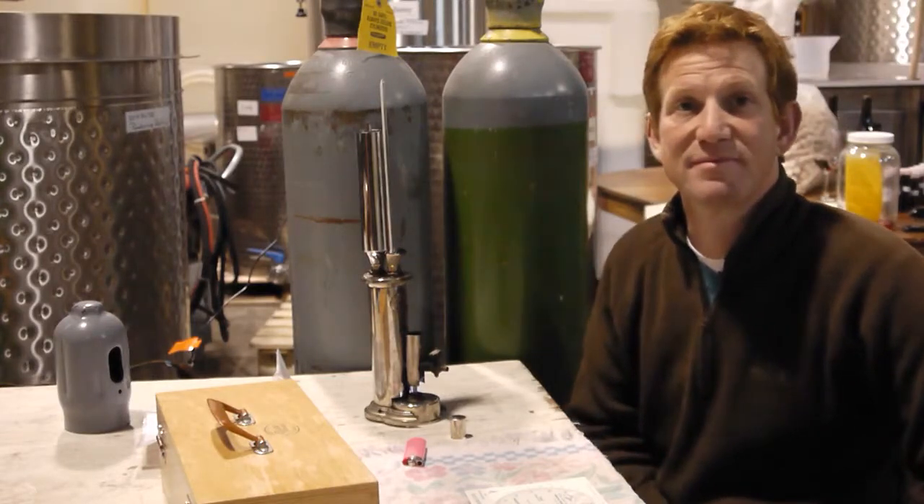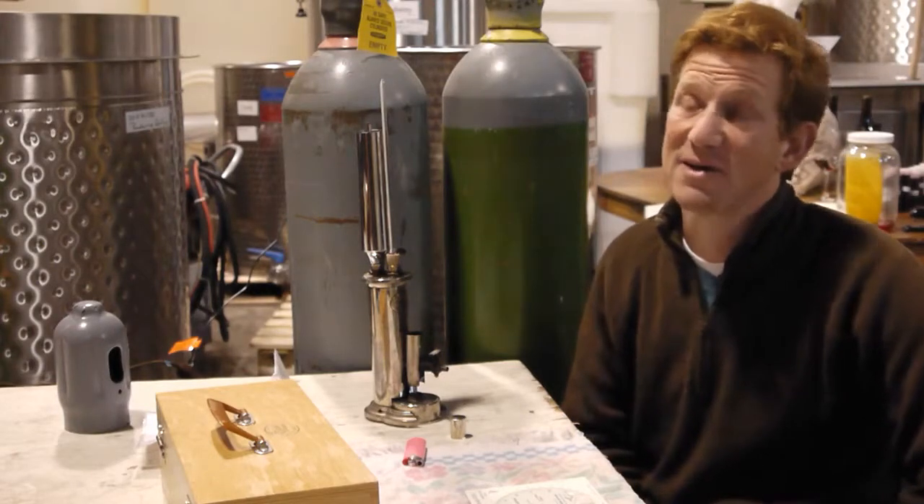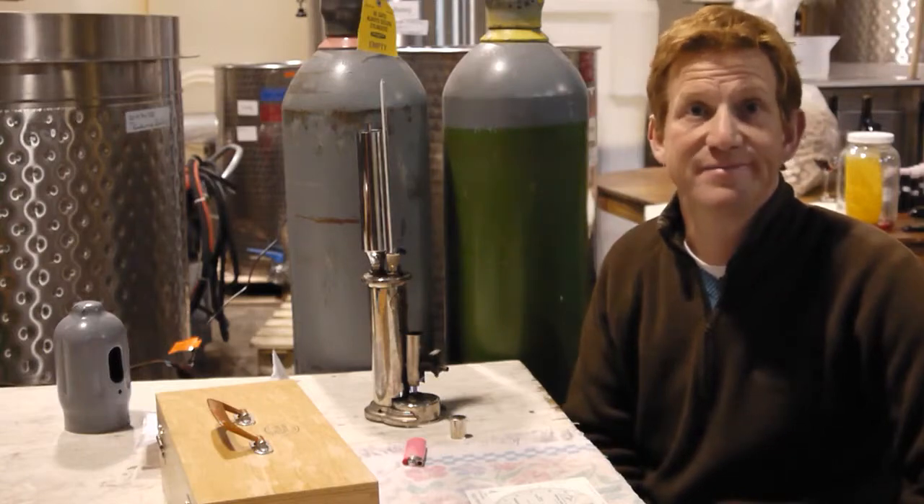And you're using it to test the alcohol levels of? The Pinots from 2009 that we'll be bottling in about three weeks. Awesome. Thanks.